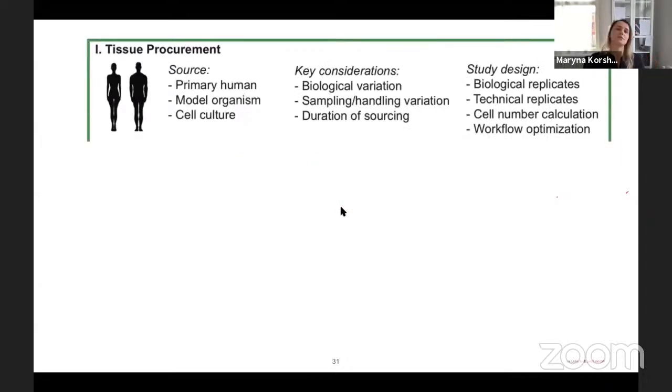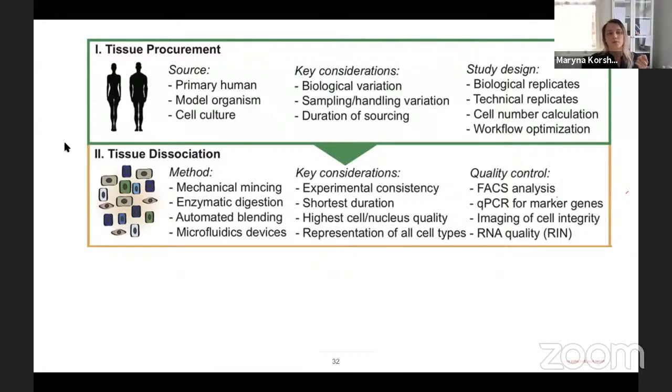First of all, you do tissue processing. You can analyze most tissues, but you have to know which kind of restriction every method or every tissue type requires. As I say, it will be highlighted in the second part of the presentation today. By the way, most protocols for different tissue types are already available. However, several technical or batch effects appear sometimes, and that is why it is very important to follow the protocol or hold problem-solving sessions with the protocol provider or your colleagues. So first of all, you isolate the tissue and try to process it according to the requirements of the protocol that you are going to use.